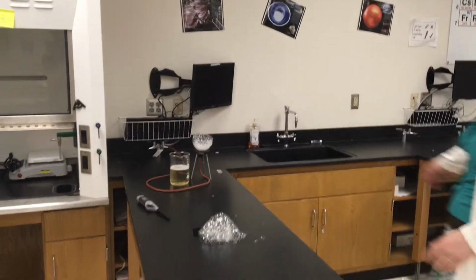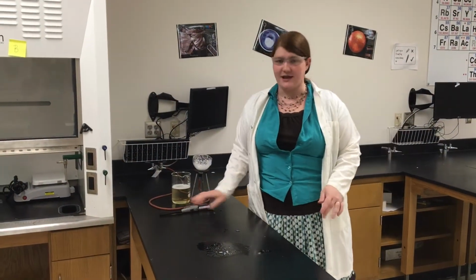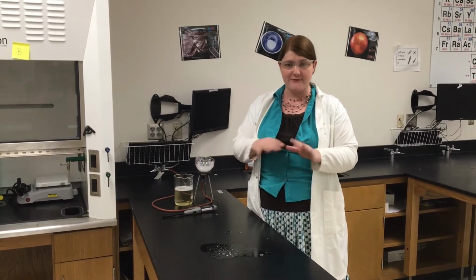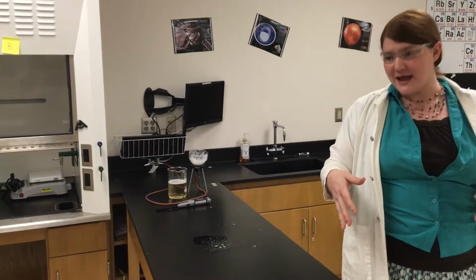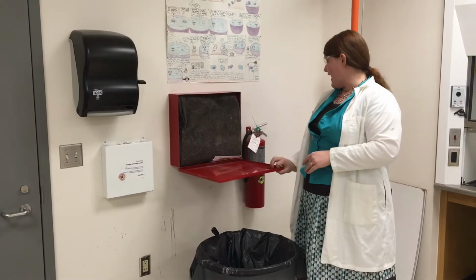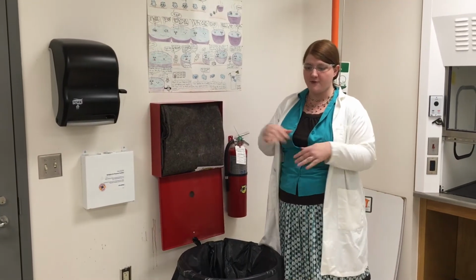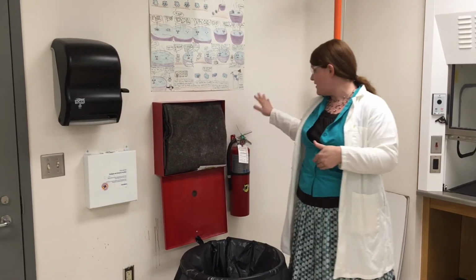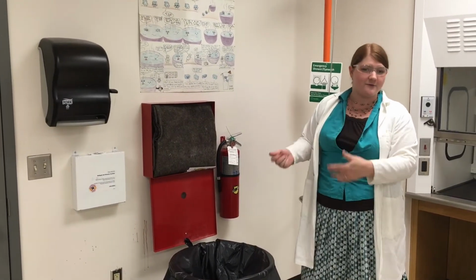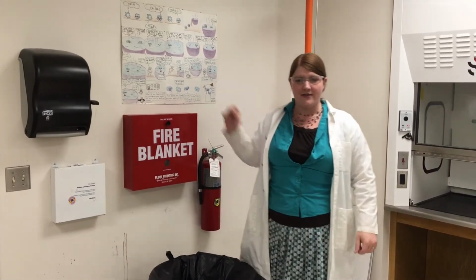Now, sometimes we're going to be using fire in some experiments, but there are some important precautions that you need to take. Make sure that your area is completely clear of flammable materials so that the fire that we have is all the fire that we get. If something does happen and there is an uncontrolled fire in the lab, every classroom has a fire blanket and a fire extinguisher. So the fire blanket, you just have to take it out, wrap yourself, cover the person, and do the good old stop, drop, and roll. Fire extinguisher, it's basically point and shoot: squeeze it, point into the base of the fire, sweep back and forth. In most cases, your teacher will handle this, but just in case you need to, that's how we use our safety equipment for fire.